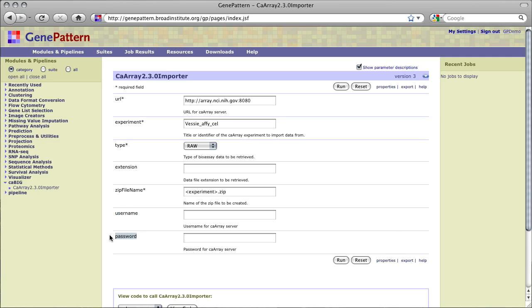Username and password are only needed if the data you are importing is private. In this case, our data is public so we can leave the fields blank.